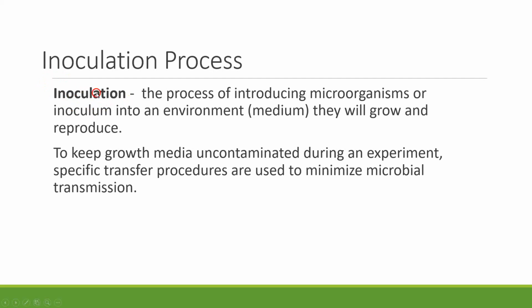If you are moving that microbe, the term we use is inoculum to represent the sample, or the microbe, or the bacteria, in other words, that you are moving from point A to point B. And then in order to keep that media from being contaminated, to ensure that your sample remains a pure sample, we're going to have to look at these transfer processes and try to maintain the best aseptic technique as we can.